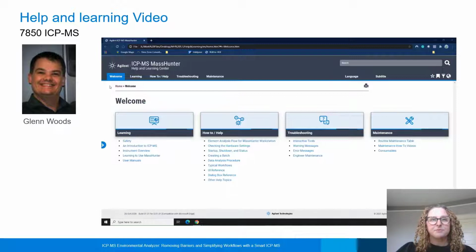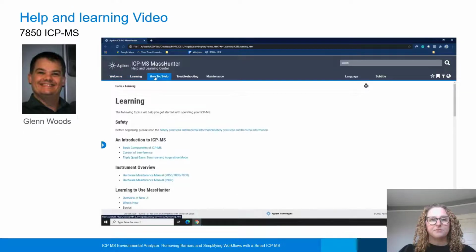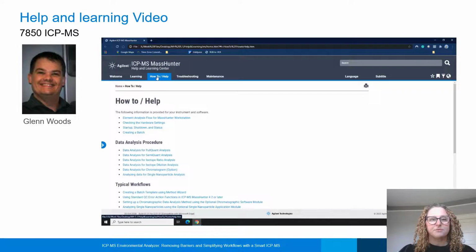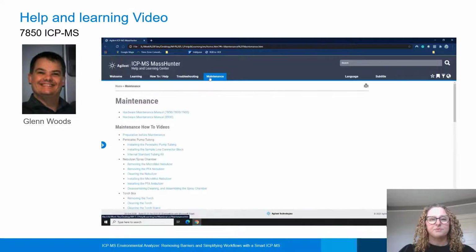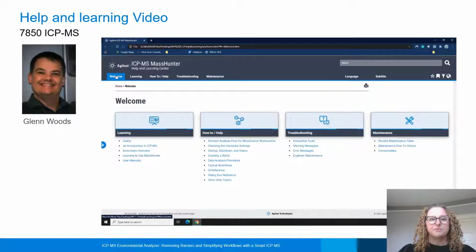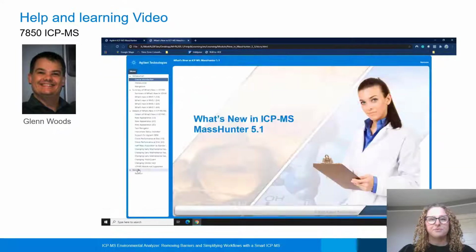Not only does the Help and Learning Center provide a base for all user manuals, it provides access to many tools, including a learning center, a how-to and help, troubleshooting, and maintenance tools. Let's take a look at some examples.